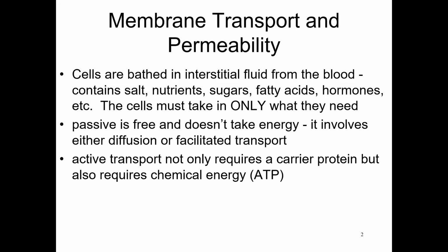If I were to accidentally dump over a bottle of a very aromatic chemical, for example, there's an artificial banana flavor that's often used to test respirator packs in the fire department and in rescue squads. They put the mask on, and then someone opens up some of this artificial banana oil, and if they can't smell it, it means that their mask is working. Essentially, it doesn't get through the mask.